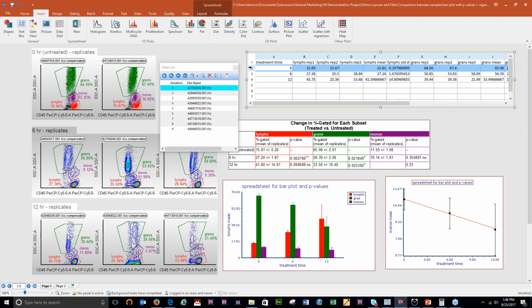Perhaps the experimenter was looking for, does this drug have an effect at all? And they don't even know which treatment time is going to be significant relative to 0. But it's absolutely up to you. In some cases, an ANOVA or chi-square might be more appropriate, and that really depends on the goals of the experiment.